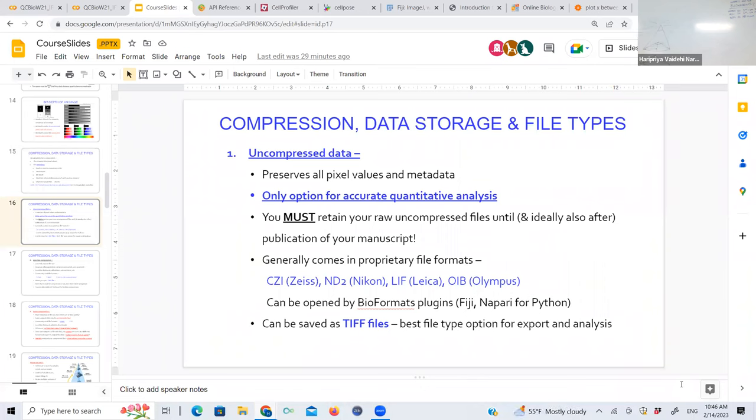Firstly, whenever you do analysis, you want to be aware of what your limitations are, right? Like what is your least count in resolution? Or how much intensity can you measure? How much size can you measure? That comes from your raw data. It's usually best to always work on your raw data. Also, don't just work on the raw data. Store it somewhere, create a copy, and work on the copy. Because your raw data is like a treasure. Treat it like a treasure that's going to go away if you so much as blow on it.